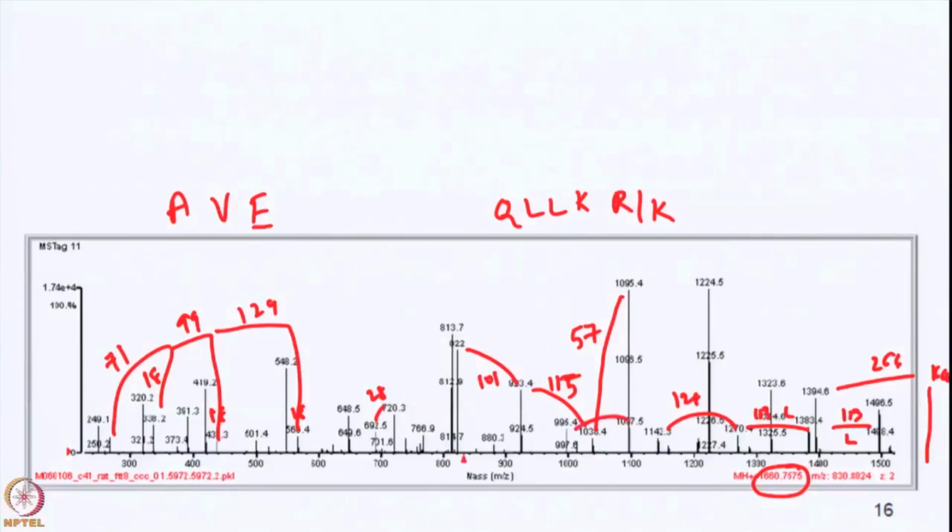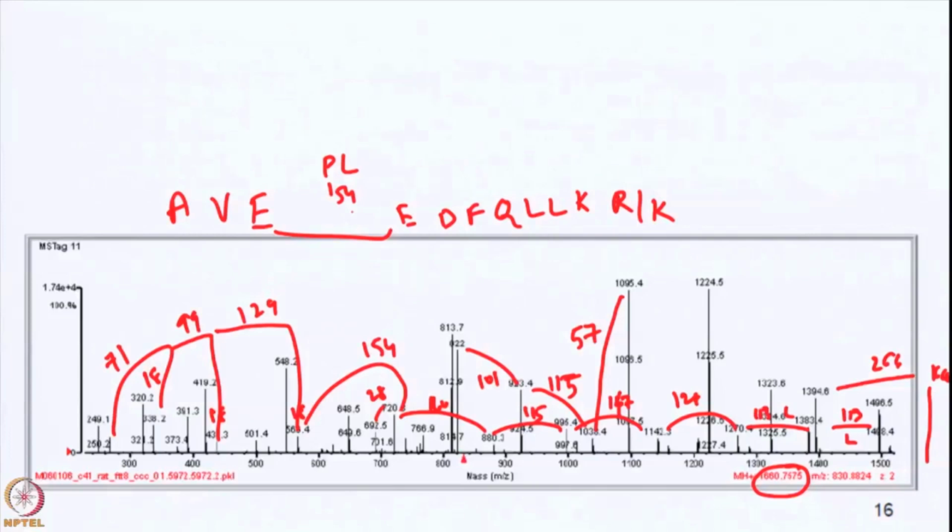Yeah. Well, I didn't intend to do that. Let's go back here. Let's keep going. 147. F. 566.